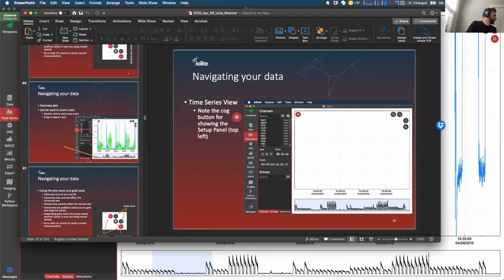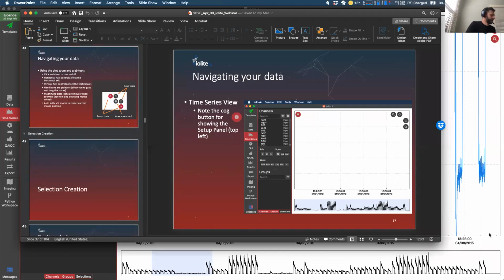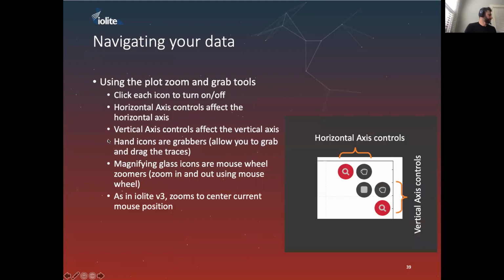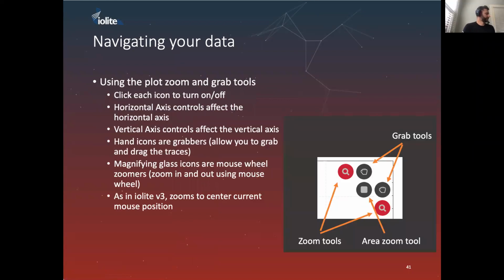So hopefully now we've covered each part of navigating your data. Hopefully now you can zoom in on any data point that you wish. There are reminders here in the presentation, so you can go back to these if you've missed anything.